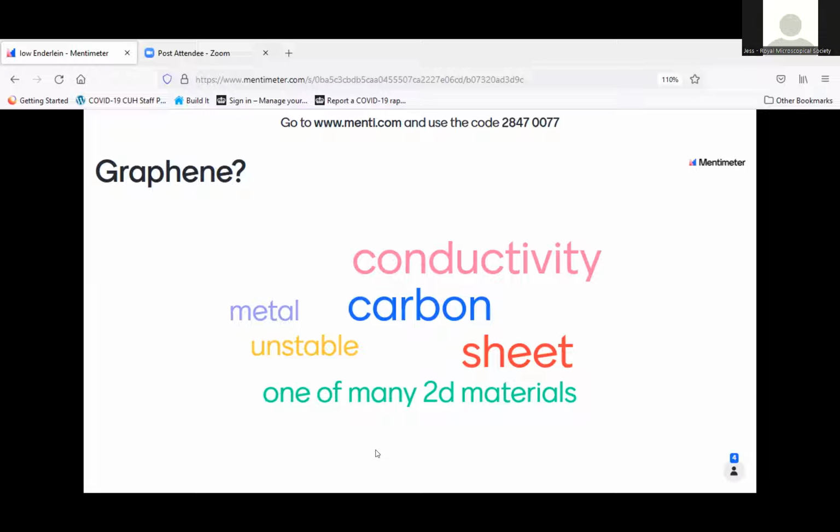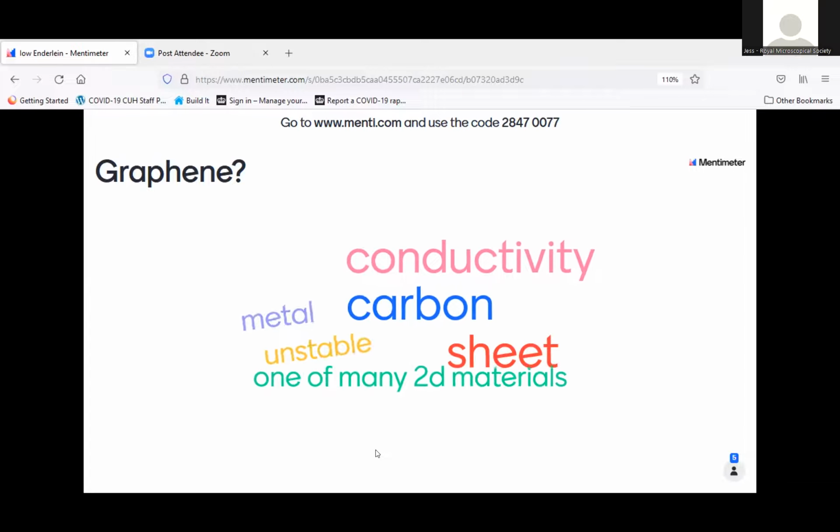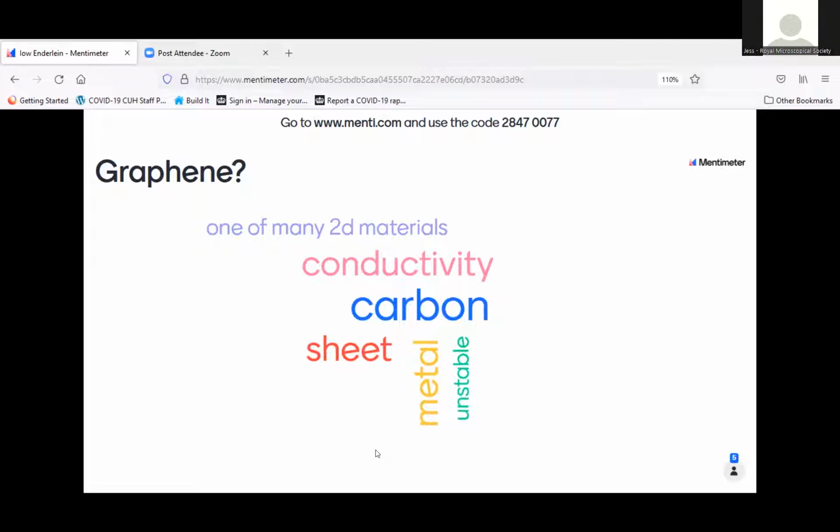It's a very cool method where you can do fluorescence correlation spectroscopy measurements. I hope you are familiar somehow with that. So basically what you look at is intensity fluctuations coming from a very tiny excitation detection volume. And then you can use this kind of fluorescence correlation spectroscopy normally to measure diffusion of molecules in solution or in a membrane.